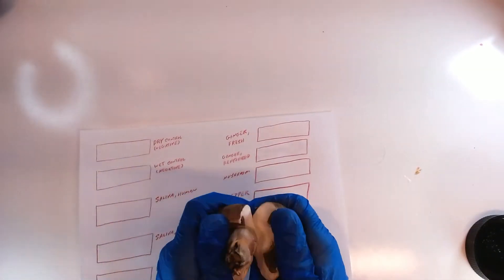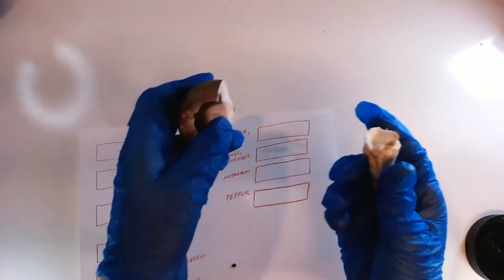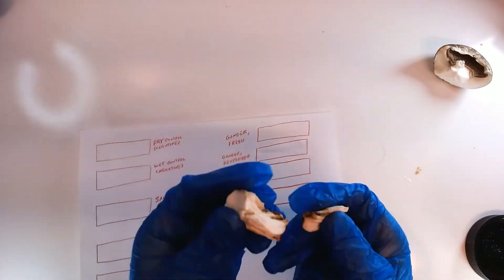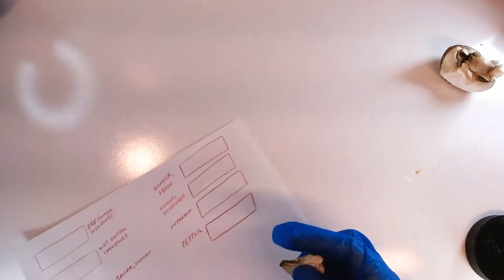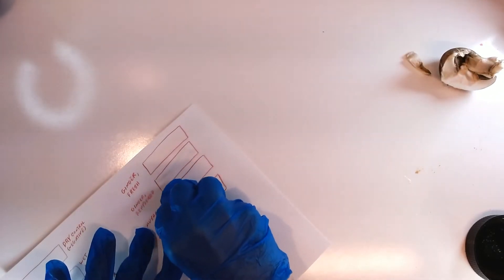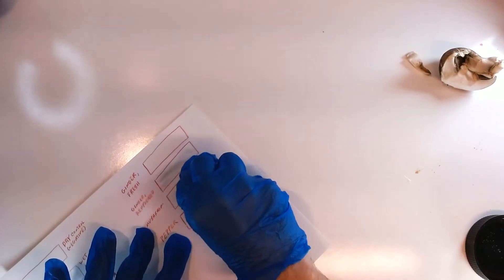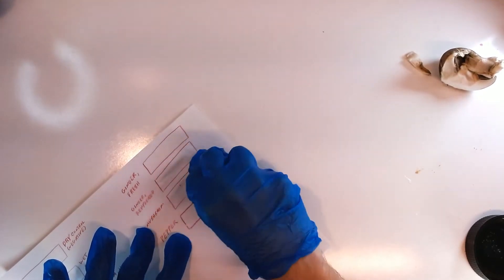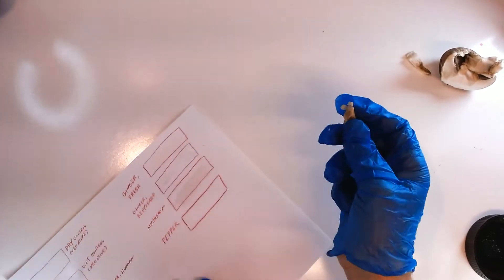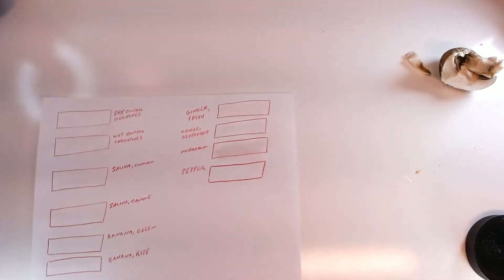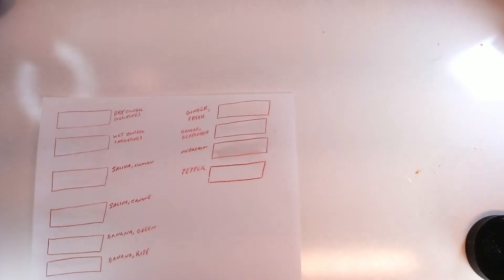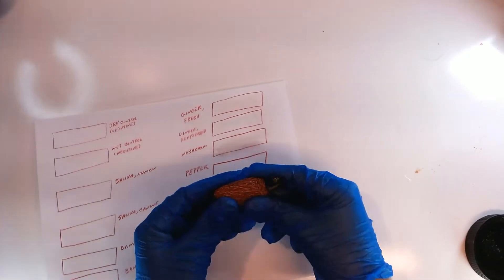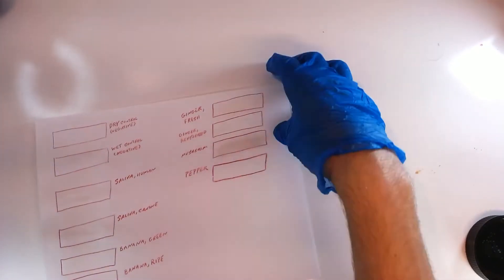The mushrooms proved a little bit difficult because they're so dry on the inside I couldn't just swab them with the cotton swab and get a good residue on the paper, so I ended up taking a small piece of the mushroom and applying it directly to the page. I ended up doing something similar with the pepper as well.